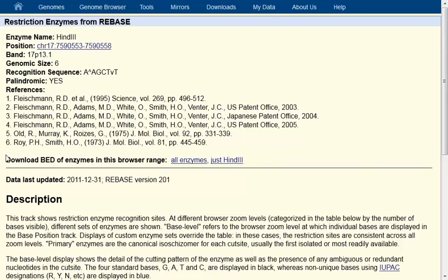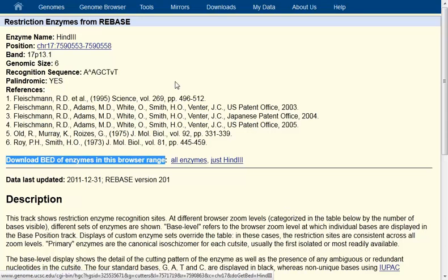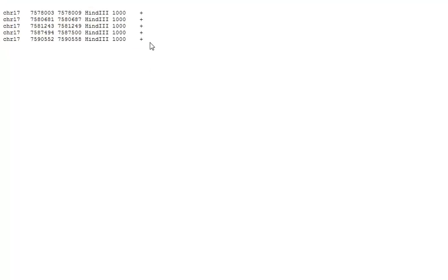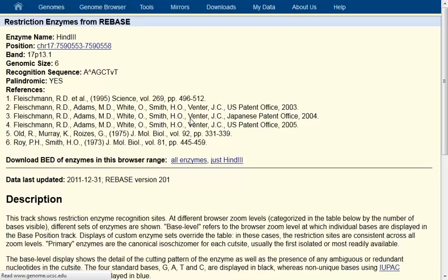Another feature you might want to use is downloading all of the enzymes in this browser range — either all enzymes or just the ones you filtered on. When you click that, you get information in BED format, or Browser Extensible Data. The enzymes are not available on the Table Browser for querying directly, but if you had a specific filtered subset like this, all you would need to do is make a simple custom track, and then you could query them in the Table Browser.